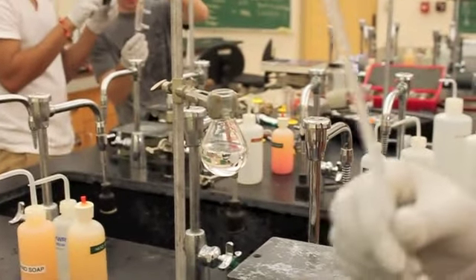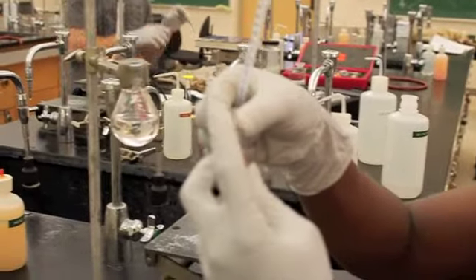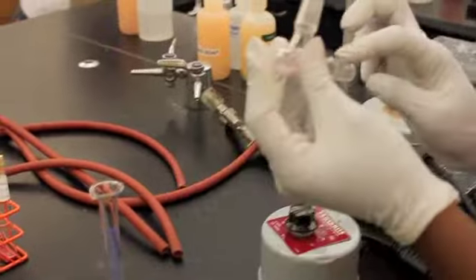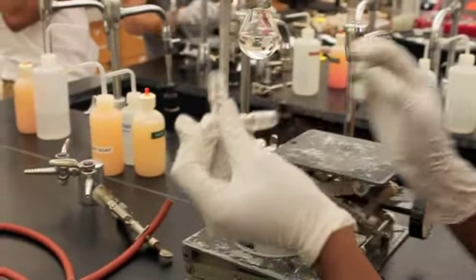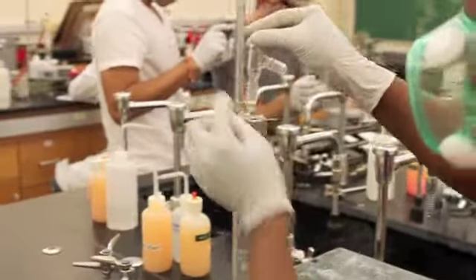Take your adapter, your thermometer adapter. Ensure you have an O-ring. Now, you want to make sure your column is as straight as possible. Use grease and oil on the joints. So I already oiled these joints, as you can see, and this is the male joint.